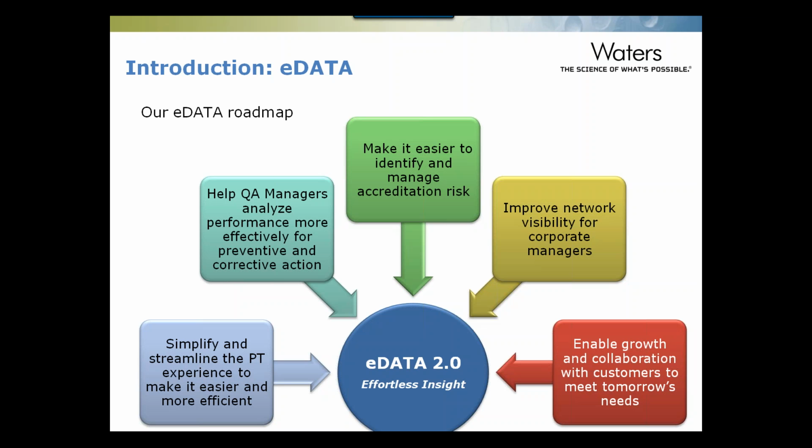In addition, for corporate networks, we wanted to improve visibility for corporate managers so they got more visibility to the laboratories within their network. And we also wanted to make the site flexible so that we can enable growth and collaboration with customers to meet tomorrow's needs. So as I said, while eDATA was launched about 6 months ago, we continue to enhance the system based on feedback from our users. And this includes building new features such as the risk report that we just released, and we'll take a look at that later on in the presentation.